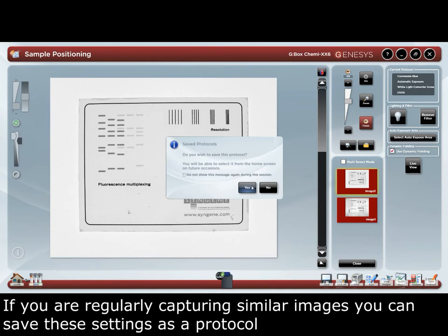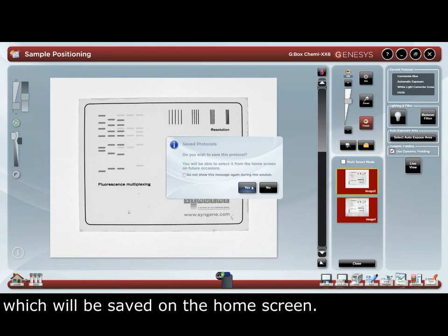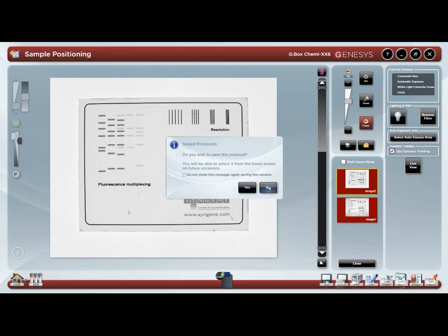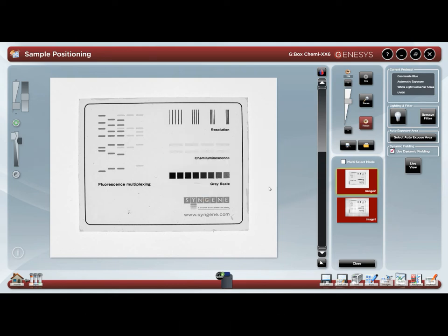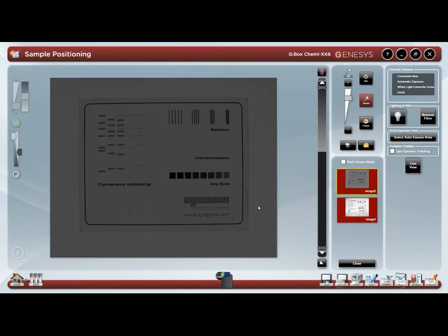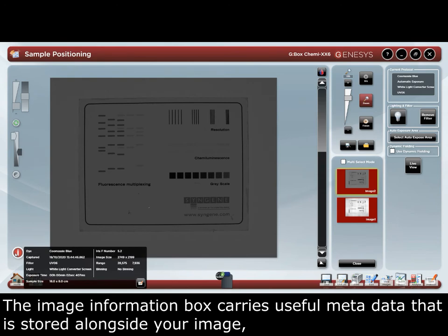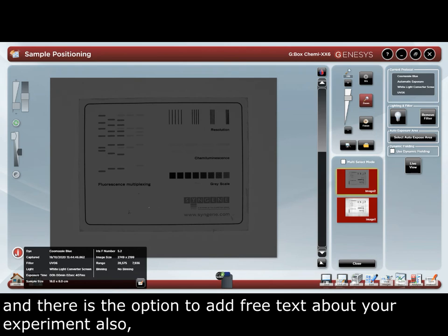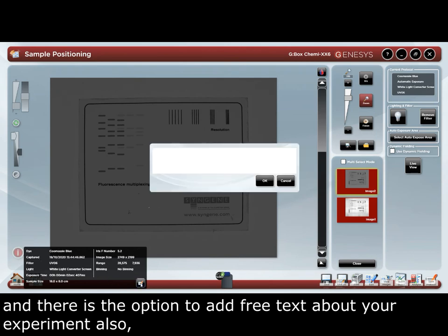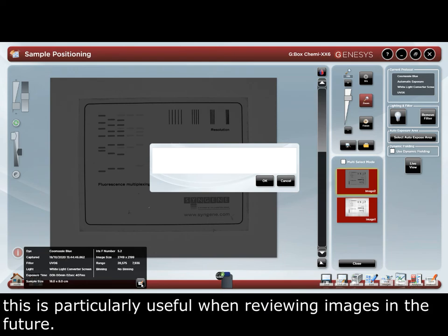If you are regularly capturing similar images, you can save your settings as a protocol which will be saved on the home screen. The image information box also carries useful metadata that is stored alongside your image, and there is the option to add free text about your experiment. These are particularly useful when reviewing images in the future.